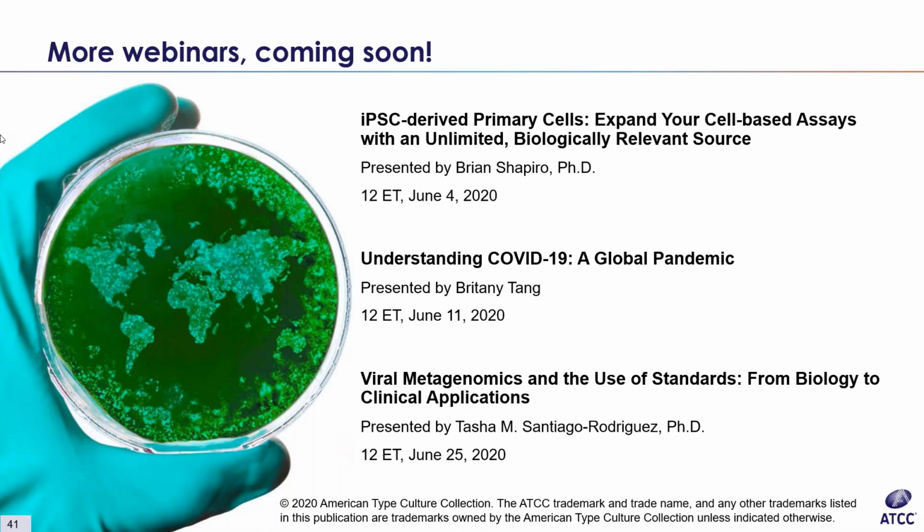I think what they mean is, and I've done this sort of thing in the past, I hate to admit, where you put the aliquots of cells that you've frozen down in the -70, and then you went off and did something and you just kind of lost track of them and left them in the -70. And then maybe a couple days later you slap yourself on the forehead and say, "Oh, I meant to put them in the -140." How long are they still good in -70?